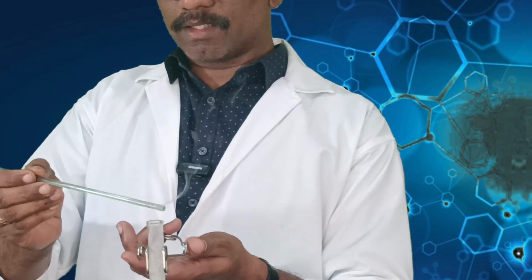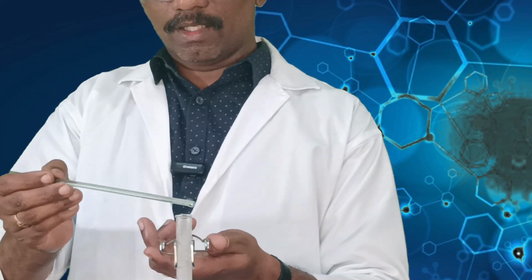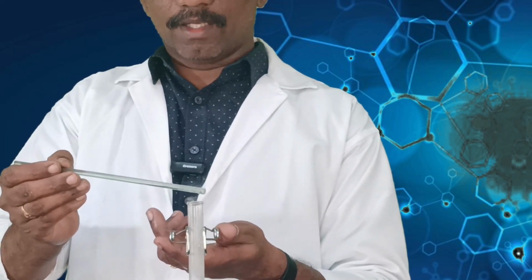The ammonia gas reacts with hydrogen chloride to form ammonium chloride. The ammonium chloride is actually visible as a dense fume. Okay, this is all the preliminary test for all the functional groups. After this, we will come to know what type of functional group we have in our compound. Then we will confirm whether the functional group we detected is correct or not by repeatedly doing 2 or 3 experiments. Okay, now we shall see the confirmative test.